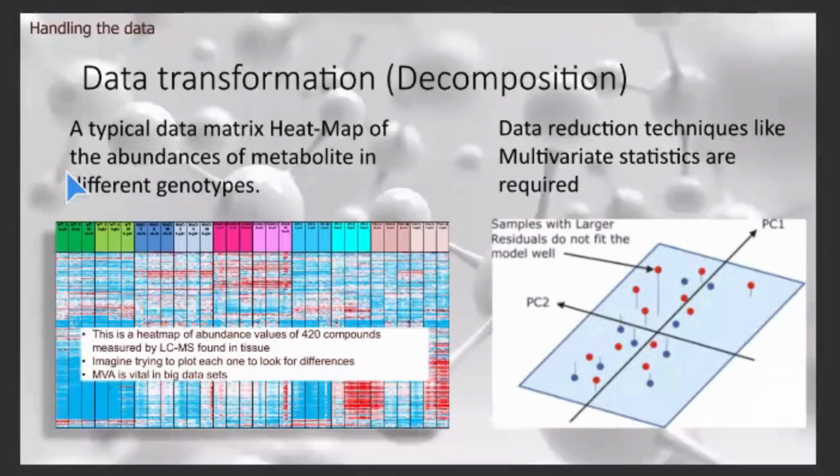We can then think about how we might want to take that data a little bit further. So here's an example of around 20-odd samples that have been analysed. What we've now got here is your samples along here and the relative abundance of the extracted peaks shown in this heat map here, and in this case we found about 420 compounds.